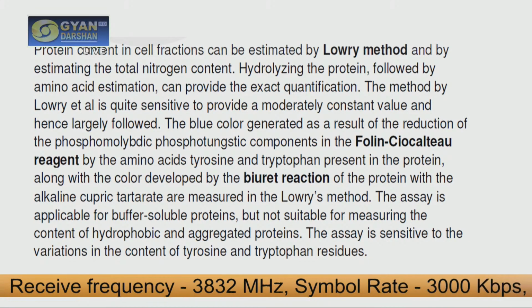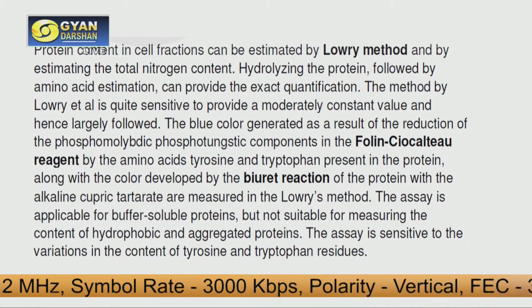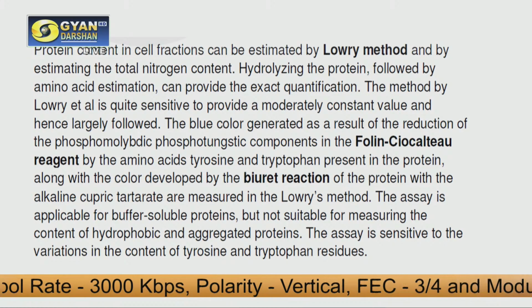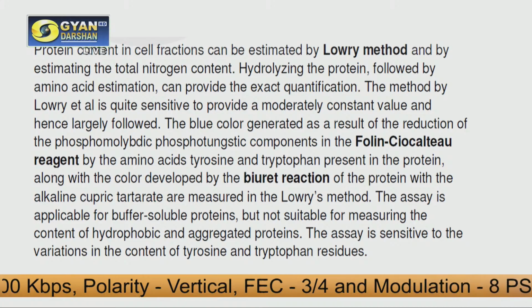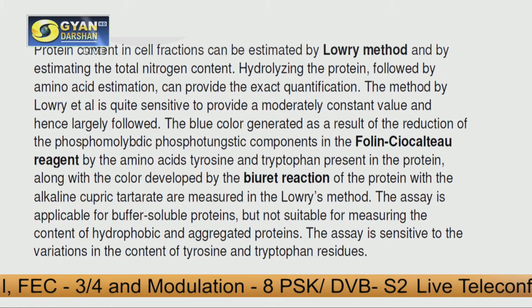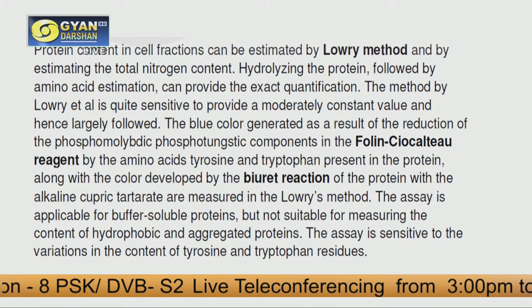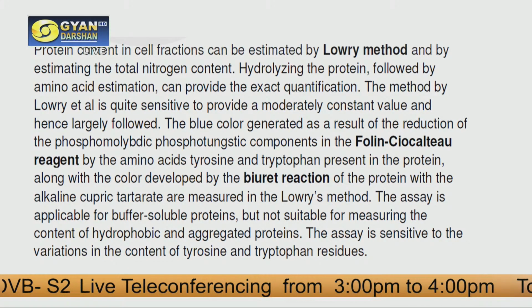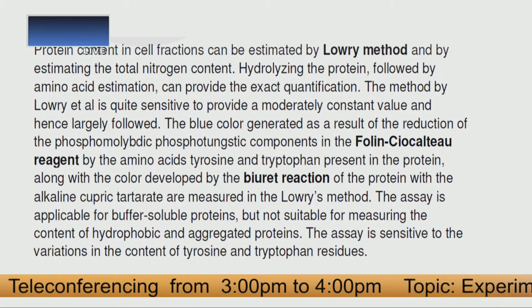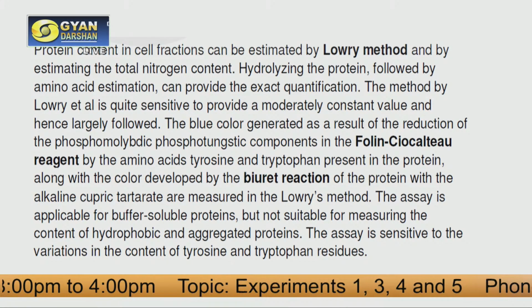So this particular method is applicable for buffer soluble proteins, that is, soluble proteins. You cannot measure the aggregated proteins or the hydrophobic proteins through this method. Only the proteins which go to the soluble phase can be detected using the Lowry method, and this is a very useful method.